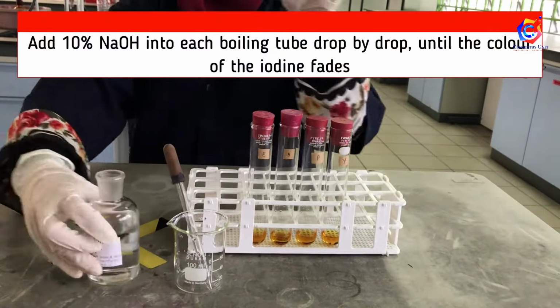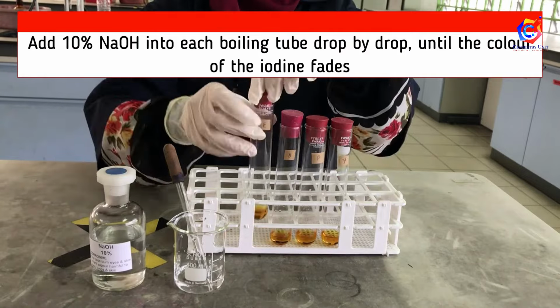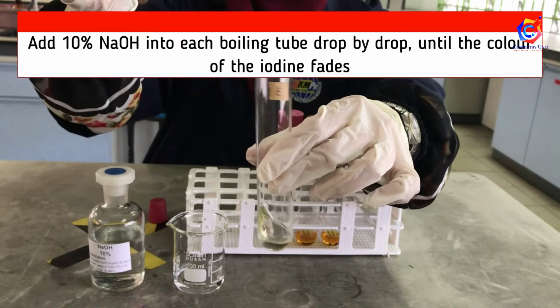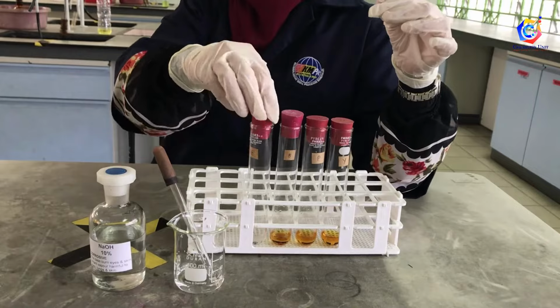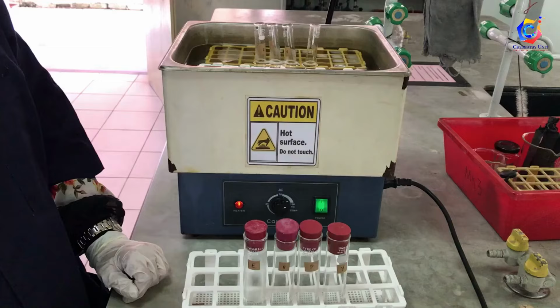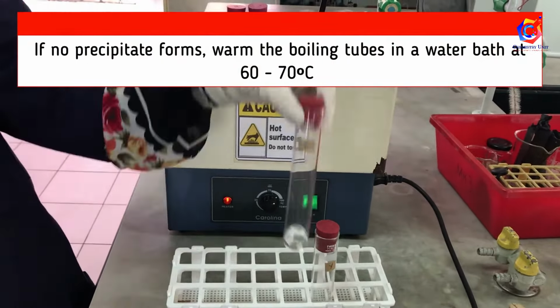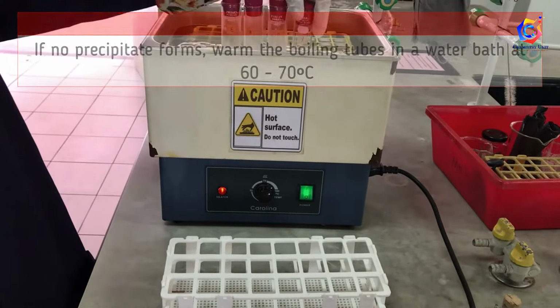Add 10% sodium hydroxide solution into each boiling tube, drop by drop, until the color of the iodine fades. Allow the boiling tubes to stand for about 2 to 3 minutes. If there's no precipitate, warm the boiling tubes in the water bath at a temperature between 60 to 70 degrees Celsius.